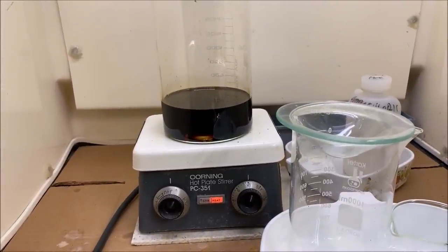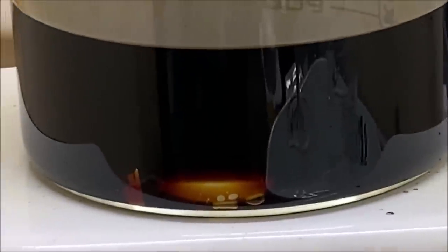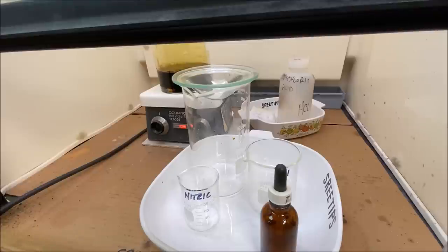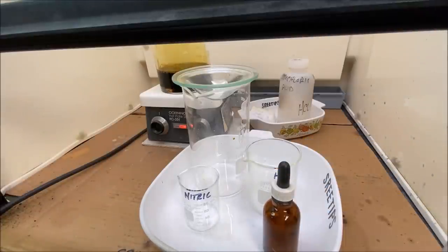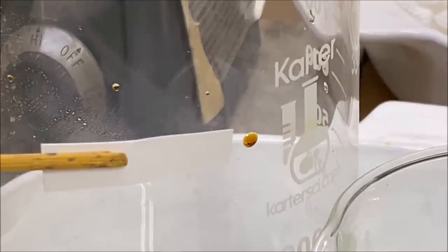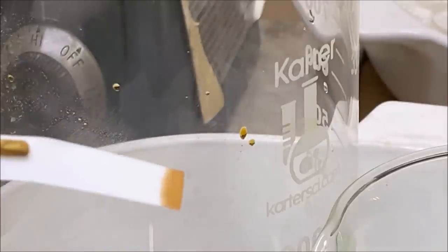And if you look down in here, you'll be able to see that we still got some chunks of metal that are undissolved. That main white piece right there in the middle is the stir bar. I need to get that out of there because my stir plate quit functioning. And now here what we're going to do, see that little brown spot on that beaker right in front there, right behind the nitric beaker? There we go. I zoomed in on it. That's a little splash of the platinum salts, the platinum solution that came up out of the beaker as I was pouring that liquid in.